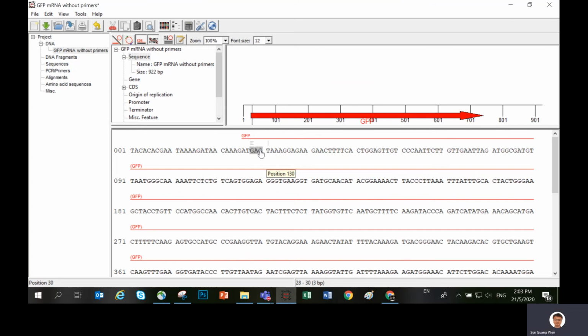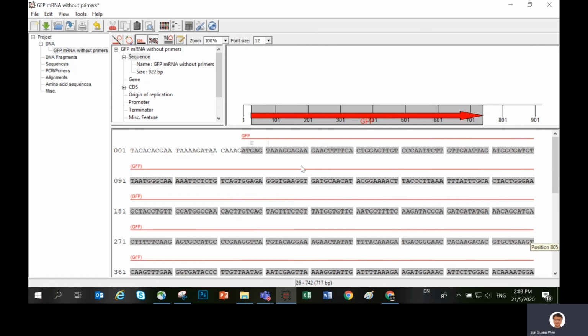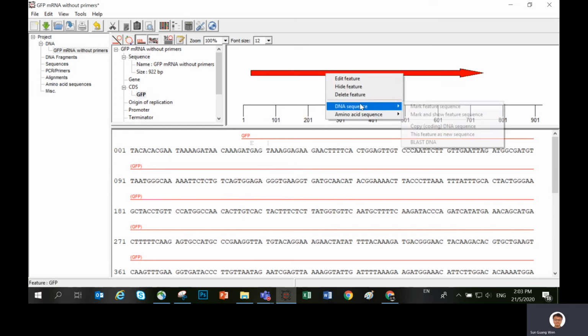Again, this mRNA will not be translated properly and you get nothing out of it. Although you have one codon, it is followed immediately by a stop codon, and in front you do not have a proper start codon. So this entire mRNA will not be translated to any meaningful peptide. That's why the reading frame is so important.